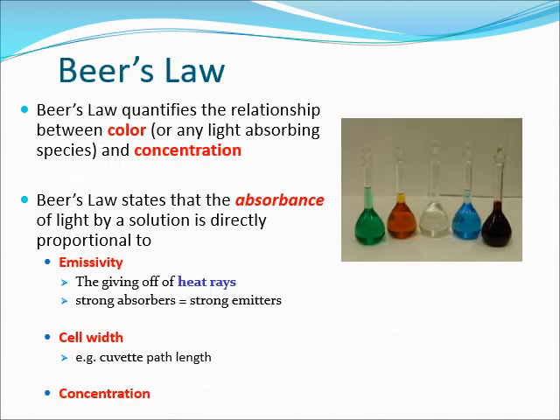So in conclusion, untuk measure guna spectrophotometer tadi, first you kena turn on the machine. Second, you kena bersihkan cuvette you, pastikan tak ada sisa-sisa dalam dia. And then you kena letak your samples, pastikan dia punya amount tu boleh melepasi the slit, yang mana allow the light. Kemudian lepas you letak your sample, you kena ada juga blank, you letak dalam cuvette juga. So you kena blank first, blank letak dalam machine. Pastikan you set the wavelength tu based on wavelength yang you nak measure, yang you study.